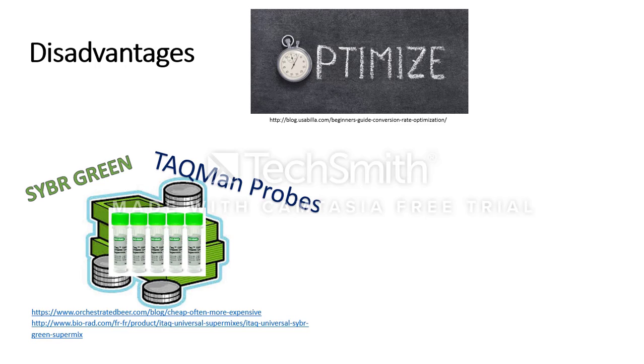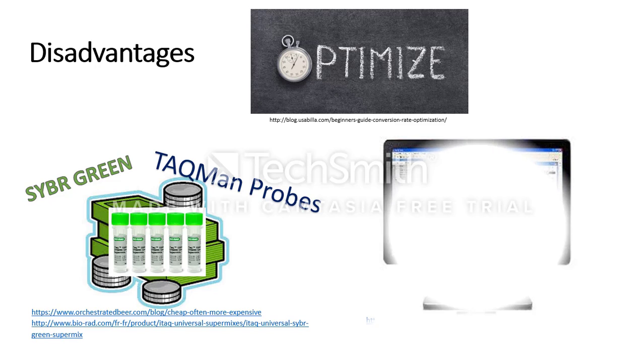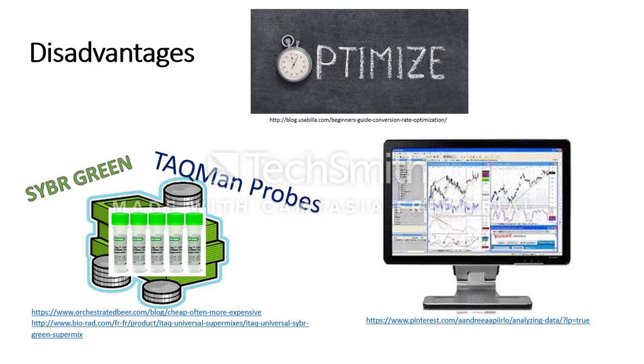Additionally, qPCR is typically more expensive to conduct than regular PCR due to the special SYBR Green and TaqMan dyes. When conducting qPCR, we often face variability in template challenges, as mRNA expression is context-dependent or highly variable between samples. This technique expresses the importance of obtaining viable samples without wasting any, for each sample can give a unique analysis.